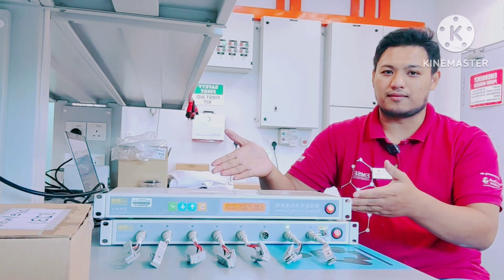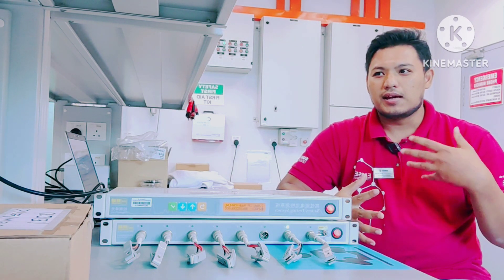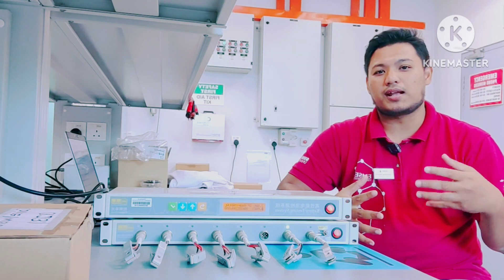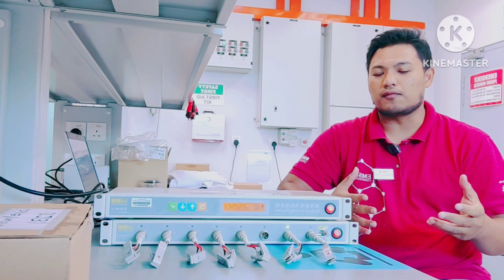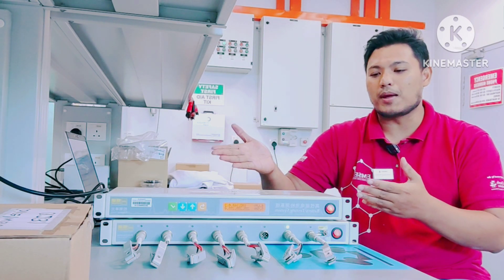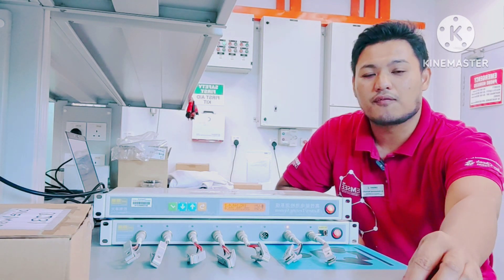Most of the electrochemical analysis for lithium-ion battery can be obtained from a battery tester or battery analyzer. So what you need to have is a complete coin cell.